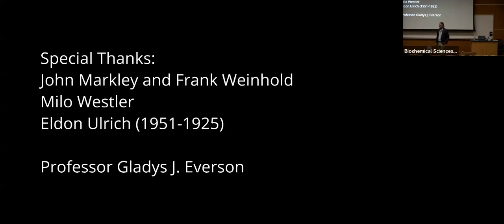If you were to repeat the experiment with buffered media so that the pH isn't changing... It's buffered, I mean, it's M9. Well, there's buffered, then there's... okay. I don't know if we would get exactly the same thing in an LB media or something. We haven't done that, mostly because we wanted to get carbon labeling. I'm not positive about that, but they do grow. I mean, they grow more slowly in M9 minimal media, but we've always attributed that to the fact it's M9 minimal media with just glucose. But they still grow happily. Are there going to be metabolism changes between M9 minimal media and LB? Yeah, I'm sure. And that's for another day, I guess, for us.